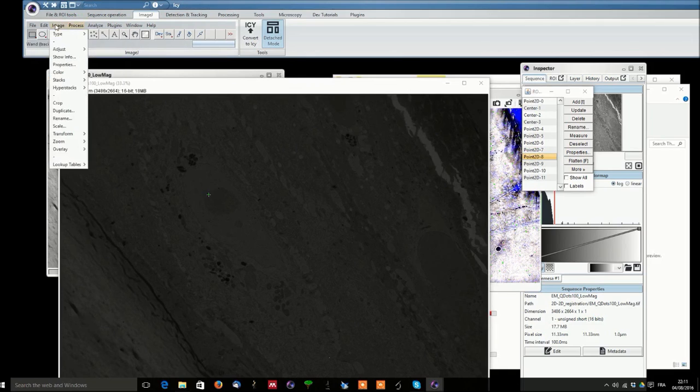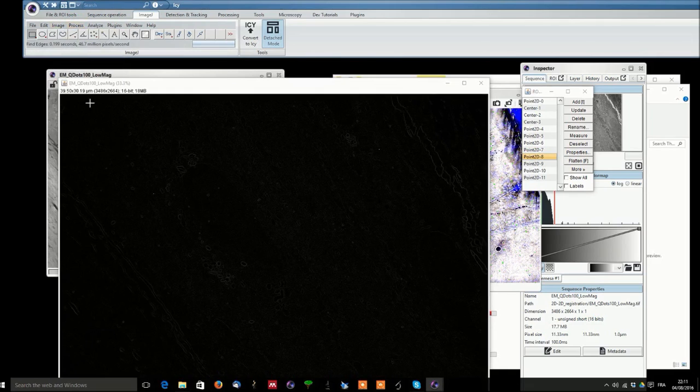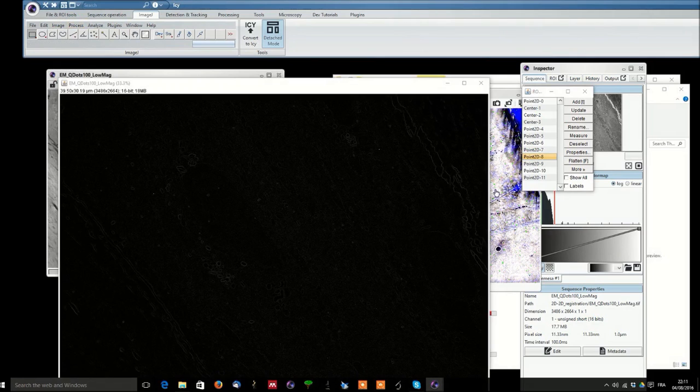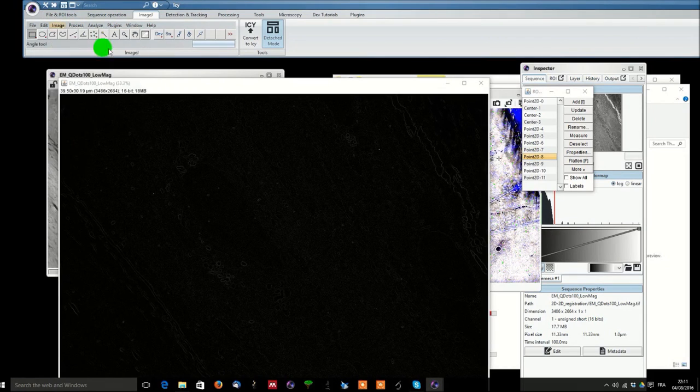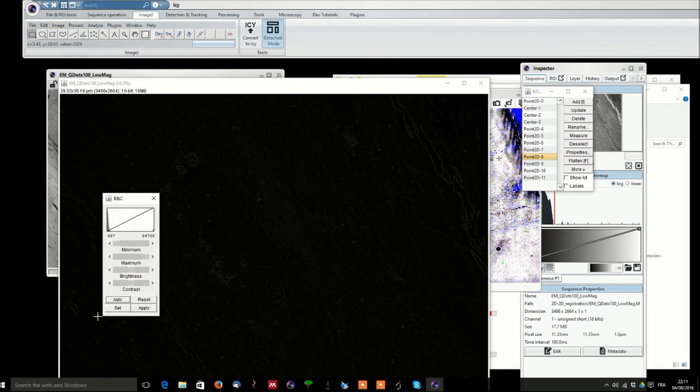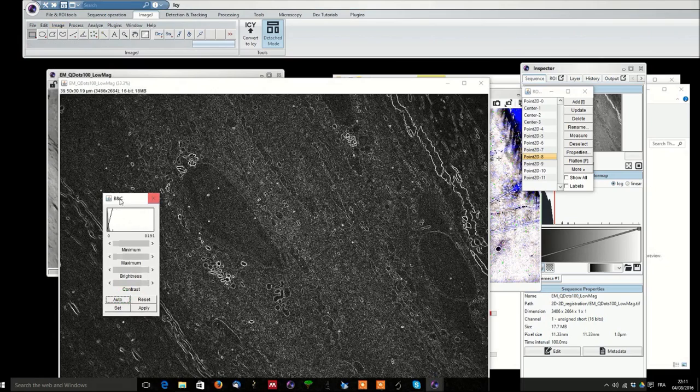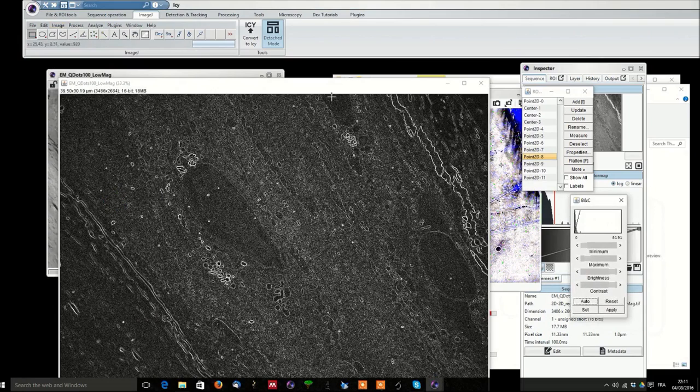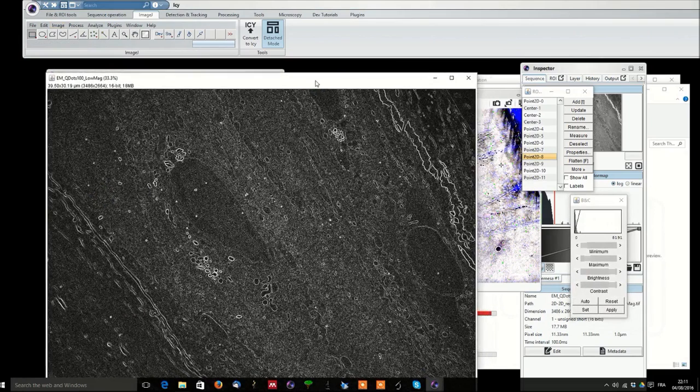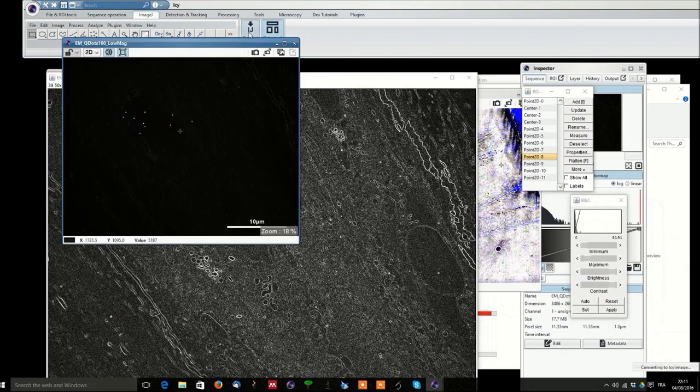You can like for example do find edges and it has found the edges. You can adjust the brightness and contrast auto and assuming this is what you were expecting to do with your ImageJ software you can convert it back to IC.